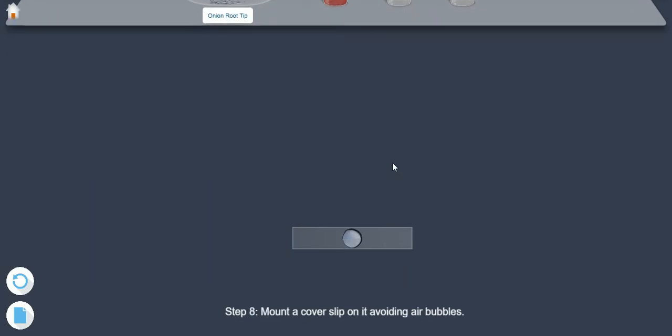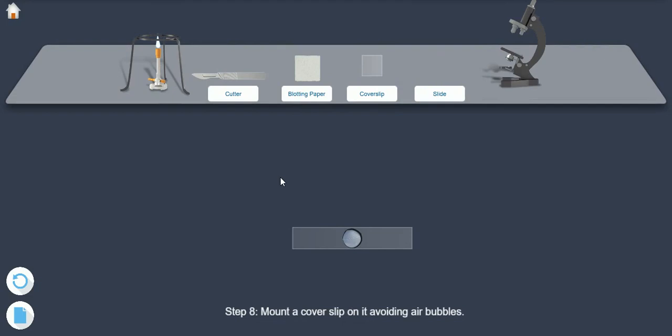Step 8. Mount a cover slip on it, avoiding air bubbles.